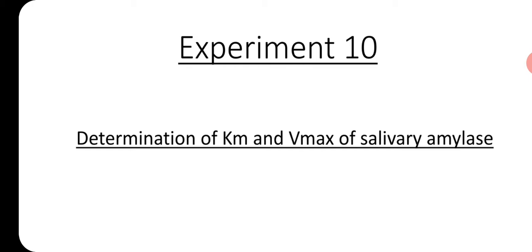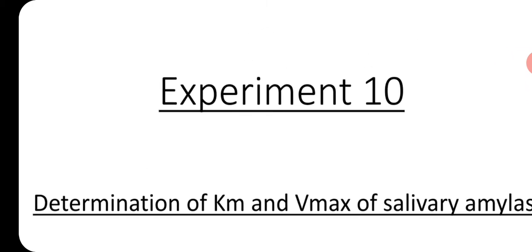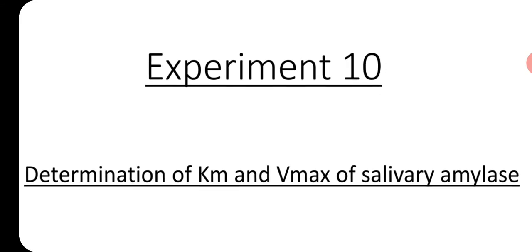You all should know that enzymes actually act onto the substrate to convert it into a product. Students, every reaction has a particular rate. That is, we are studying it in kinetics, right? So every reaction where an enzyme is acting upon the substrate to convert it into a product is going to be studied over here also. But in this experiment, we are mainly talking about the kinetics part. But don't worry, you are not going to involve too much in the calculations.